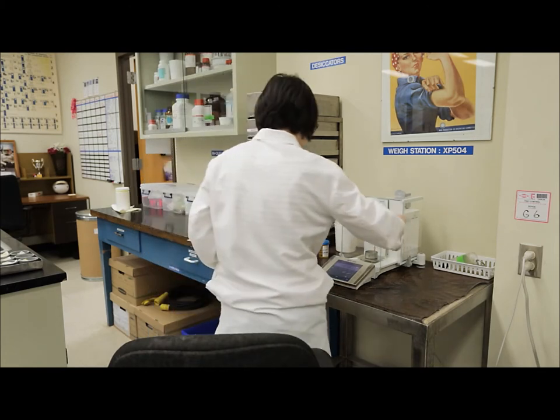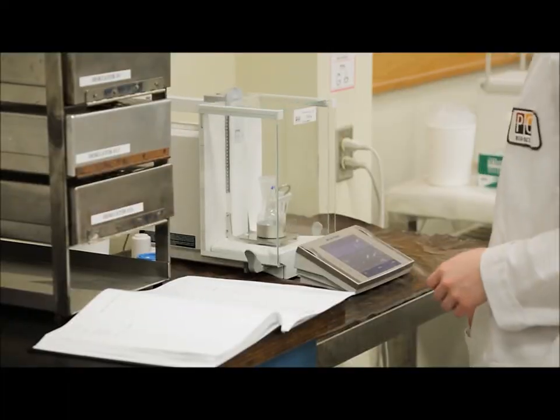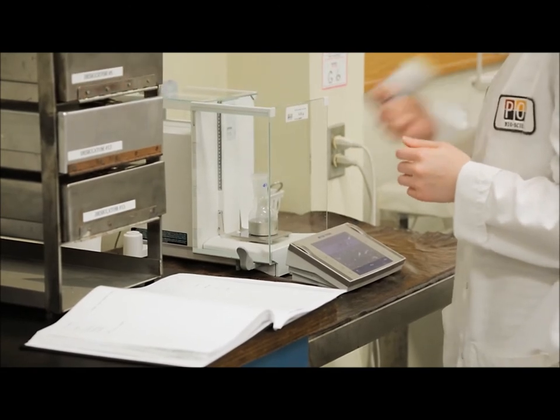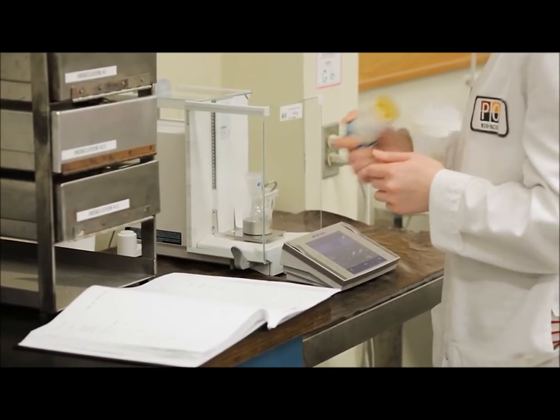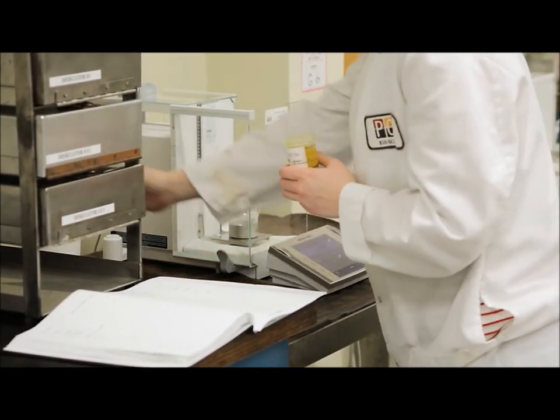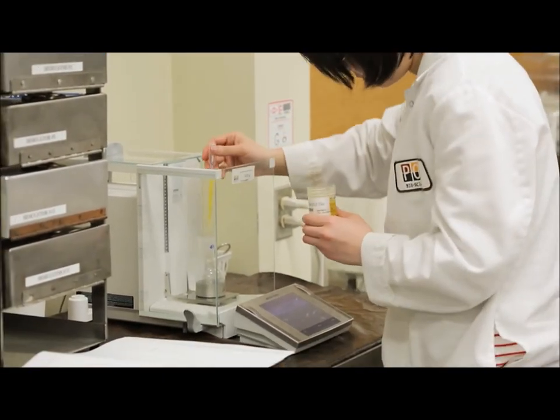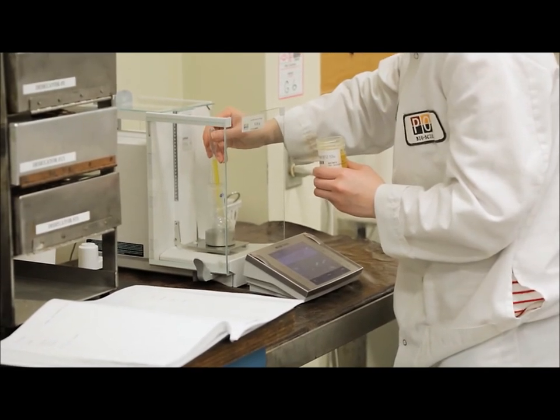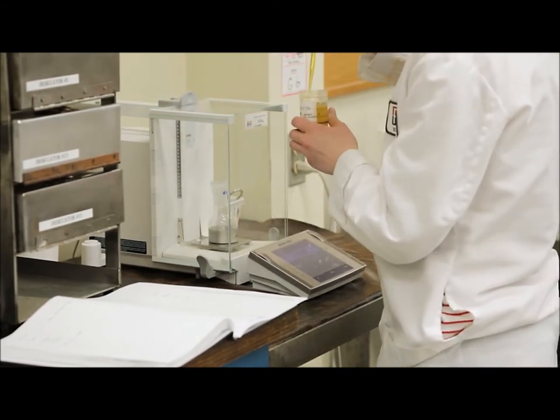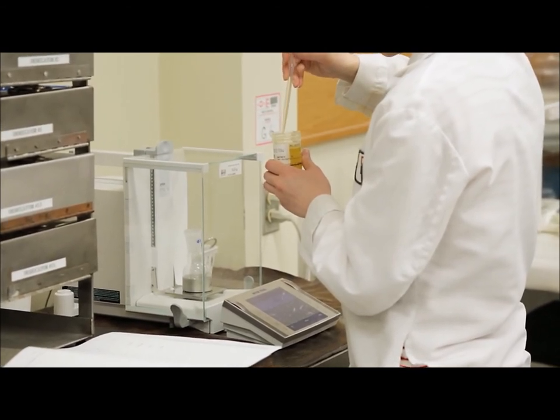When starting the fatty acid composition analysis, the first thing we do is subsample our sample and weigh it into a round bottom boiling flask. It is critical at this point that the sample is mixed well because you want to be subsampling from a sample that is homogeneous and uniform throughout. We weigh approximately 0.1 grams into the round bottom boiling flask and this sample weight is recorded.